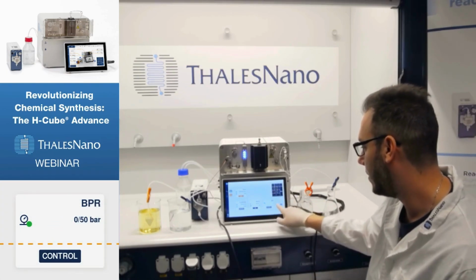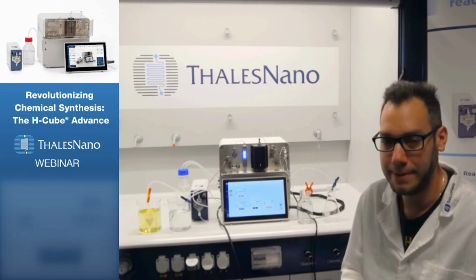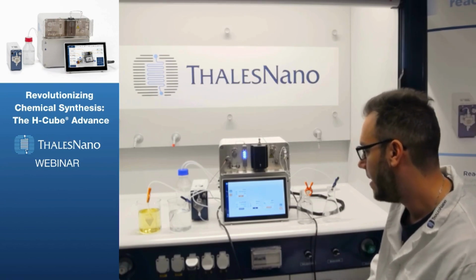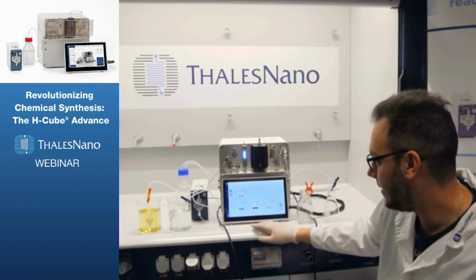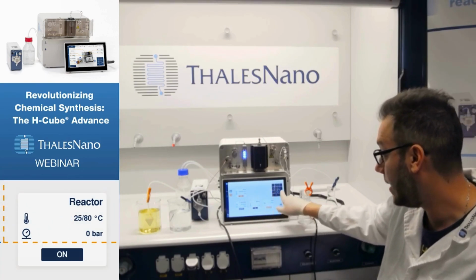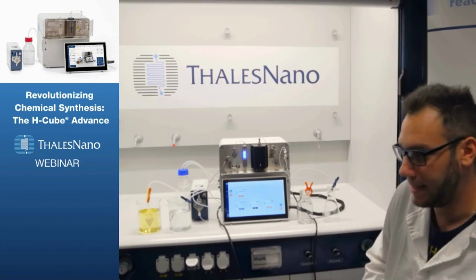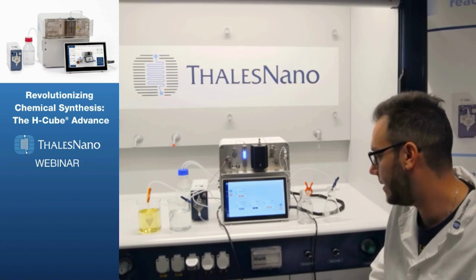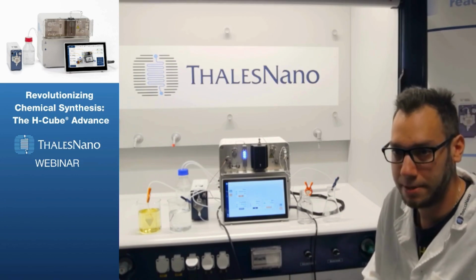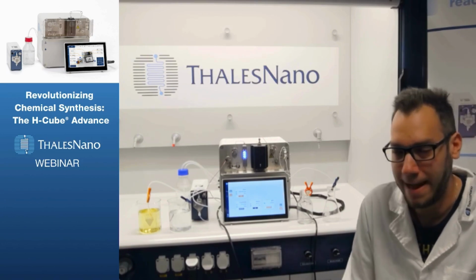So I'm just going to put in 50 bars and press control. I would like to wait a few minutes until this pressure is achieved. While we are waiting for that to happen, I can already put in the 100 degrees C temperature. I am not going to press the on button just yet, because I want to build up the fluid pressure first, which takes approximately 5 minutes.